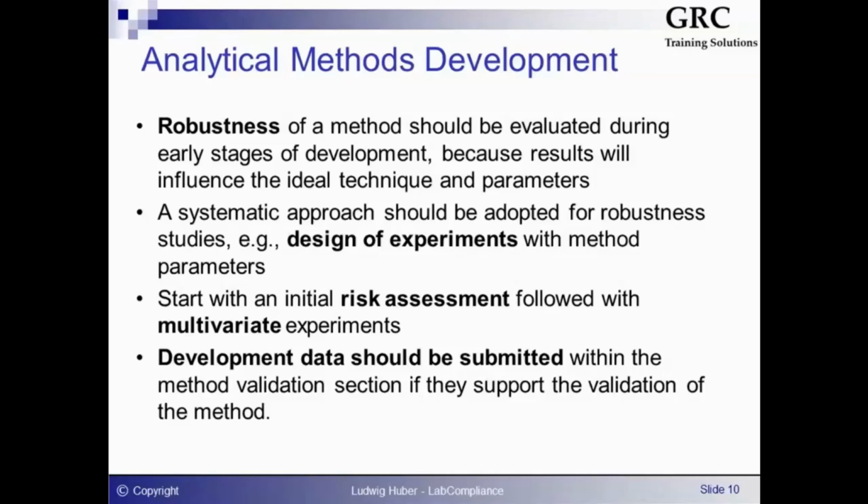I think which is basically nothing new because also method validation in the past or currently is requiring to be done. The experiments should be done under GMP conditions, and so it's basically the same like now.